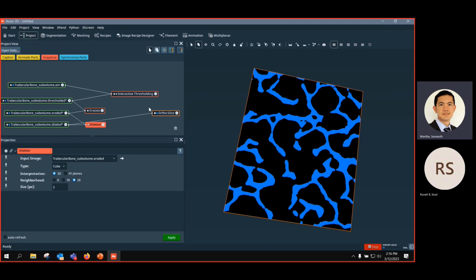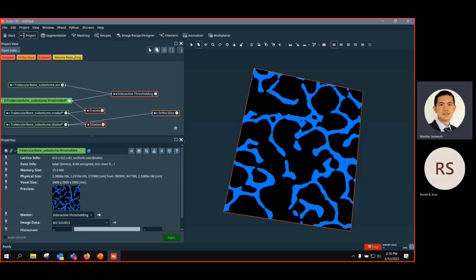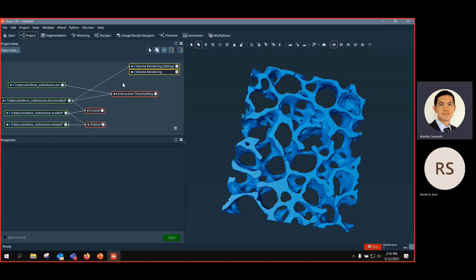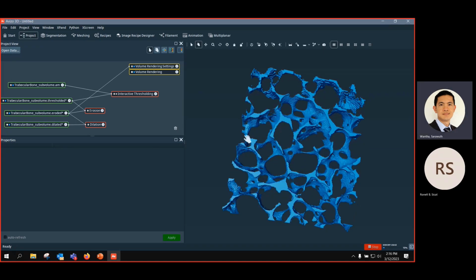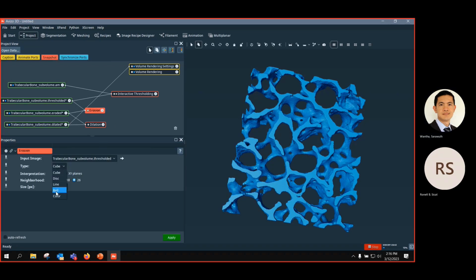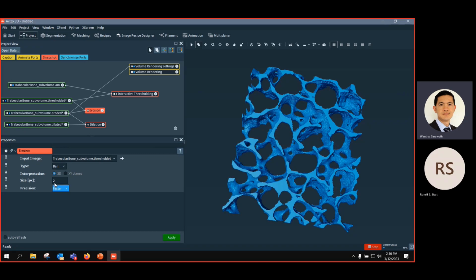But yeah, if you look at the original data before breaking, I have something like this. And after you do erosion, it's thinned at the very thin points, only the thick part is left, and then you just dilate it back. So this is a kind of opening. Maybe I should use ball to make the effect clearer. So ball maybe 2, just to see. Maybe 3.